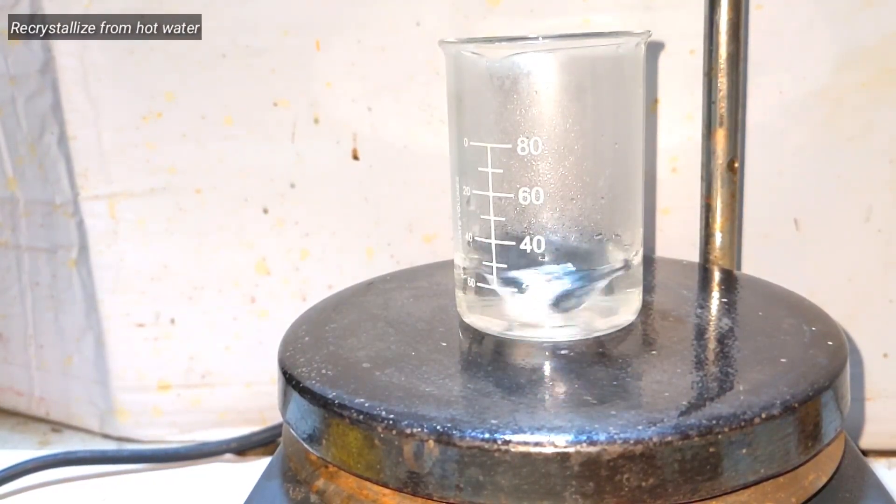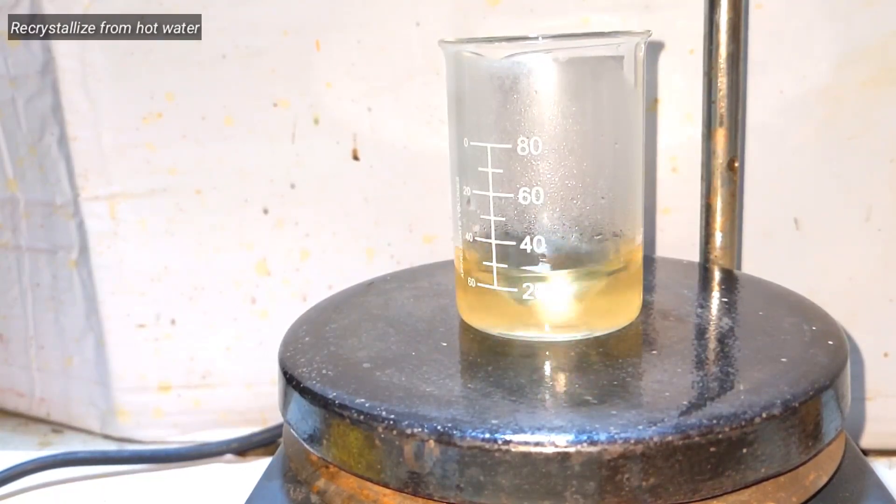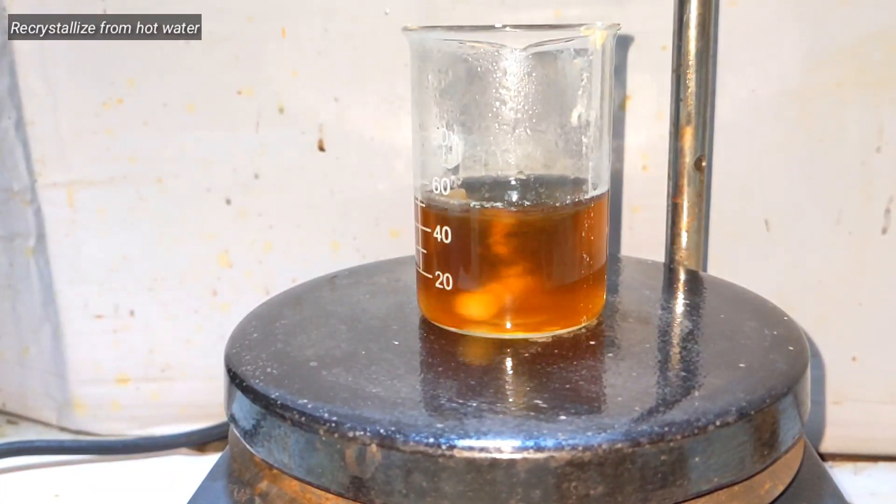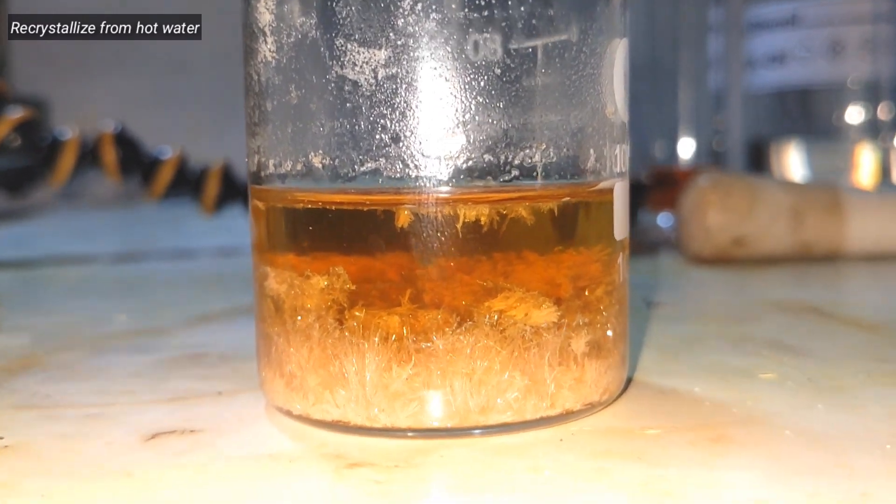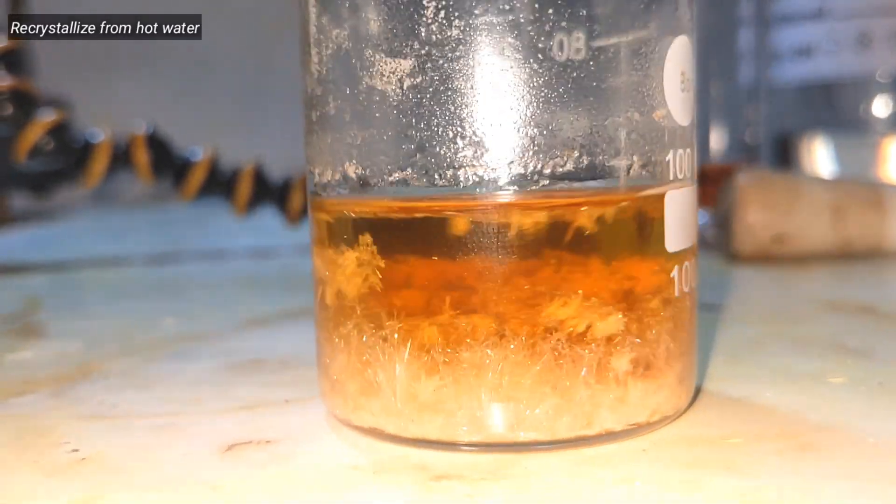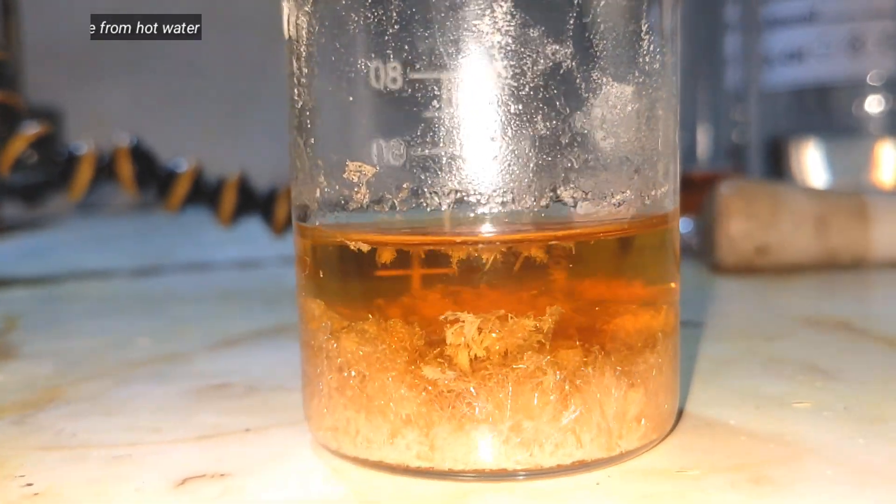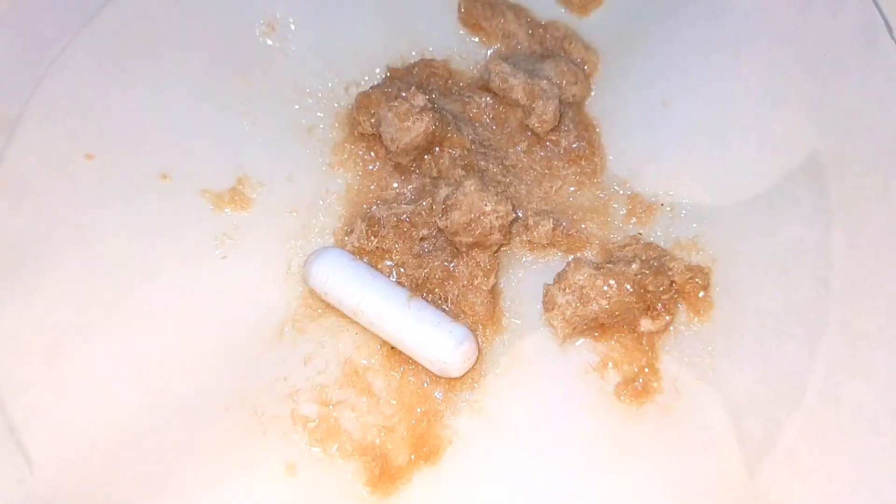It was then dissolved in a very minimum amount of hot water and was recrystallized. On cooling, needle-shaped crystals of 2,4-dihydroxybenzoic acid separate out. It was then taken out of the beaker and was dried.